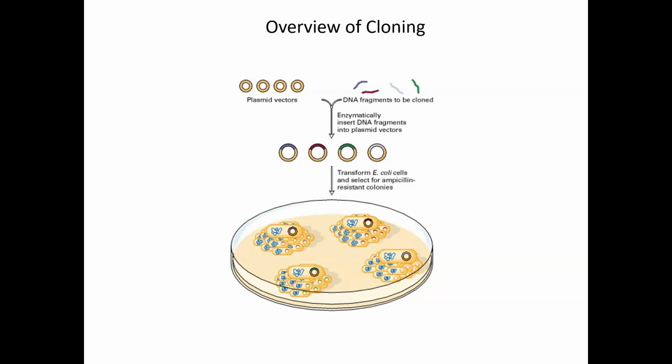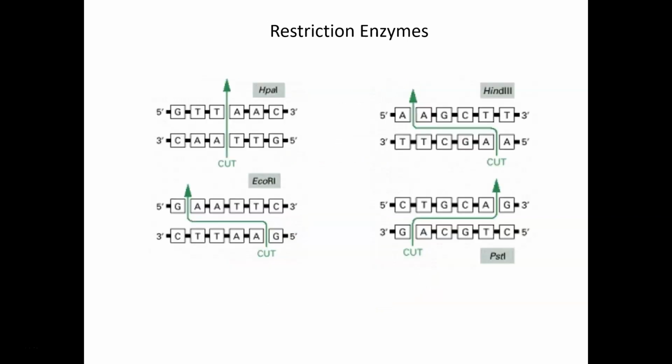The scope of this course doesn't really go that high, but we can do this with a variety of different plasmids. So we can actually transform multiple plasmids into E. coli cells, and we can actually create what are called DNA libraries. We can have entire genomes represented on thousands and thousands of independent plasmids, and we can transform those plasmids into host cells. So I just wanted to introduce this so that you have this notion that it's not always just one plasmid per cell. We can get multiple plasmids transformed into cells if we plan the experiment properly.